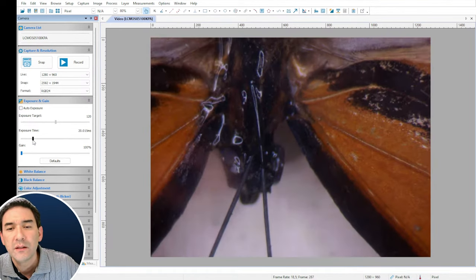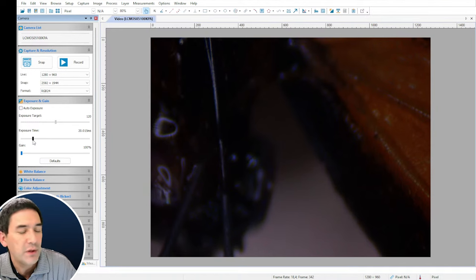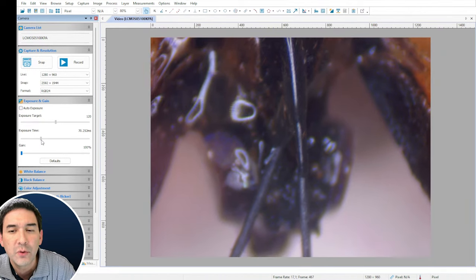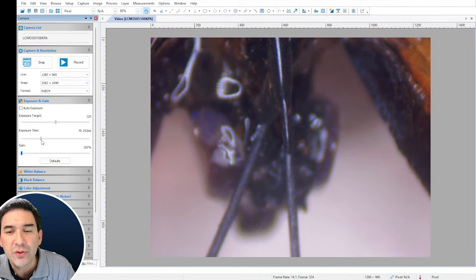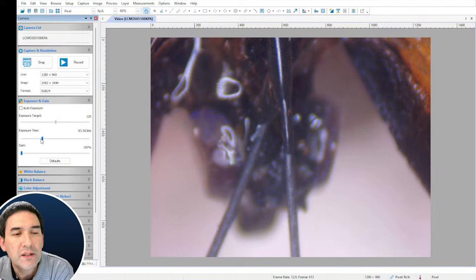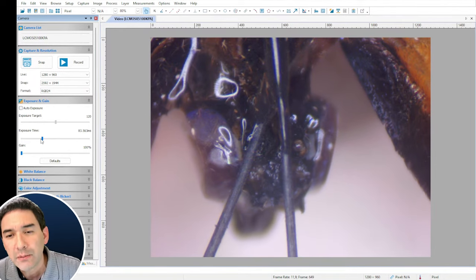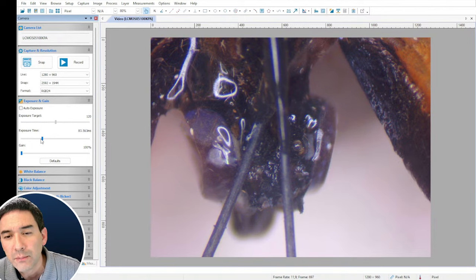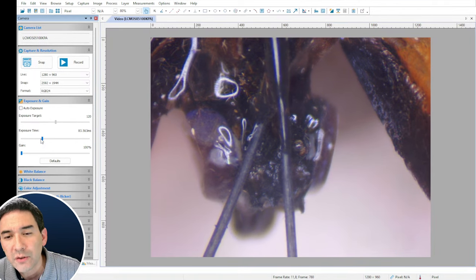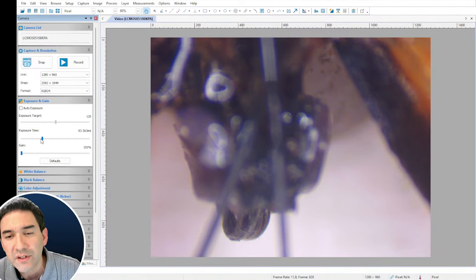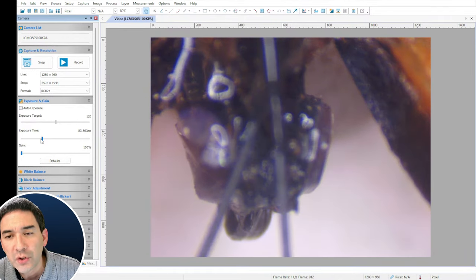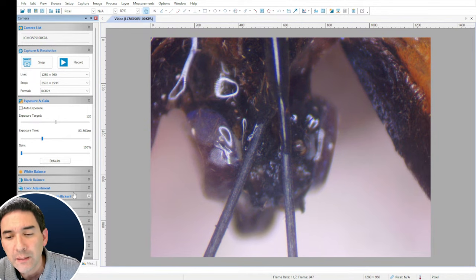I could increase the gain but that might introduce noise, and since I'm taking still images anyway, exposure time is not a problem. Now we're able to see much better — the antenna is in focus at the top but the bottom part not so much, and as I focus down the bottom part comes in. I want to get an image which is in focus all the way through, so I'm going to capture a series of images.